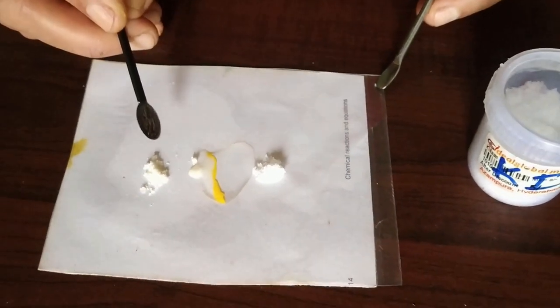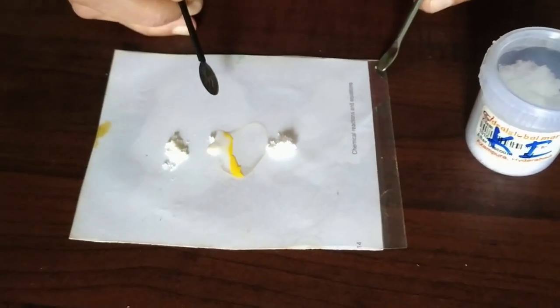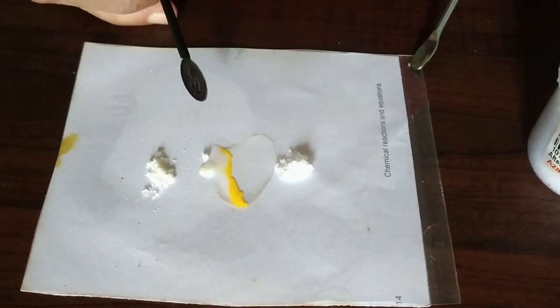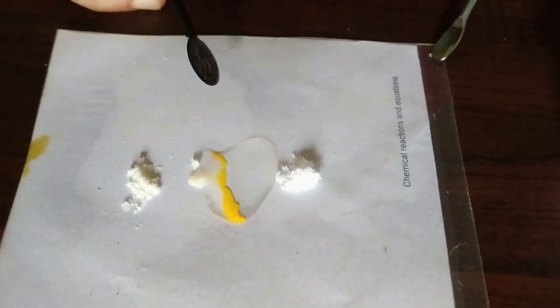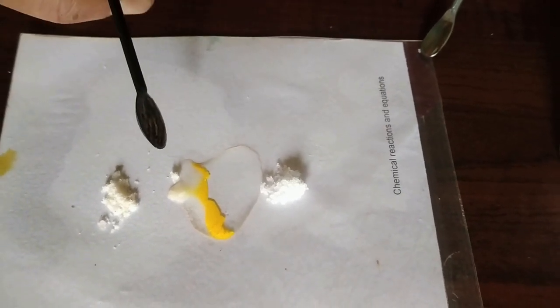We can now see a yellow color line towards lead nitrate, but not at the center. It is at that point where lead is meeting iodide ion. So the yellow color precipitate is lead iodide. Now the question arises, why is not the precipitate at the center? The reason is lead is heavier than potassium. So lead moves very slowly. By then iodide comes and meets it. So the precipitate is formed towards lead nitrate.